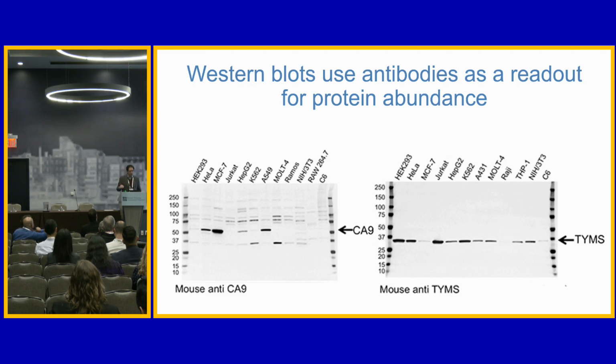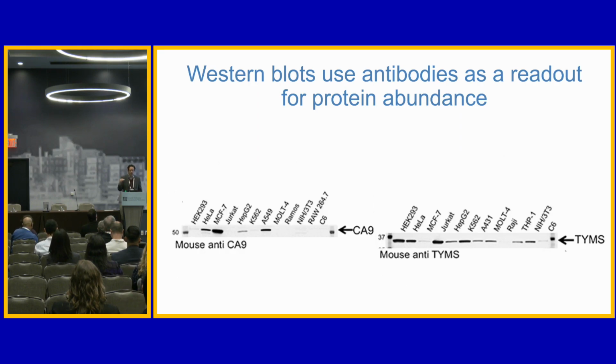And so oftentimes we forget about these different aspects, the fact that it's a two-part assay, and that both of those parts are important for making the assessment, because usually when we're reporting these in the literature, they end up looking like this, right? And they look exactly the same no matter what you're looking at. And this is particularly important when we think about circumstances where we're working with a single antibody binding event.